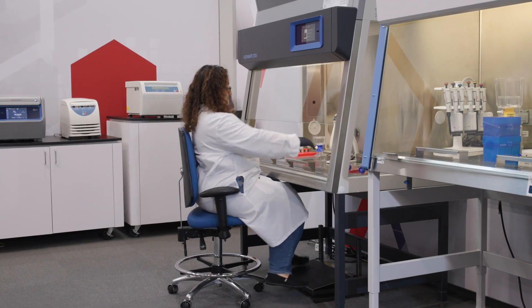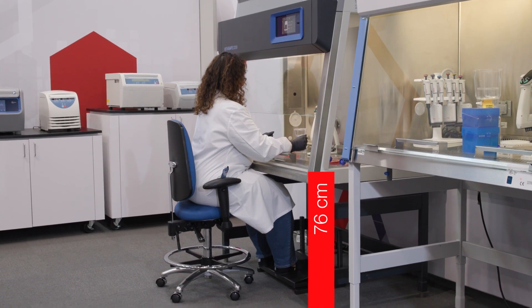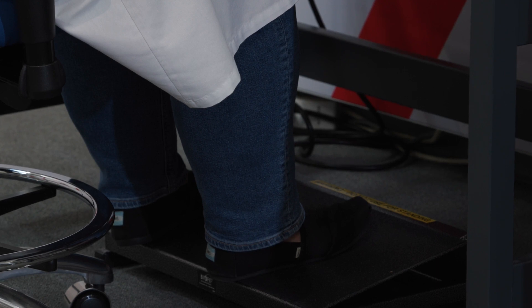Remember, the anchor point is our forearm resting on the armrest and parallel to the ground. If we have the cabinet at the standard 76 centimeter work height, Michelle lowers the chair and the footrest is lowered to 11.4 centimeters.